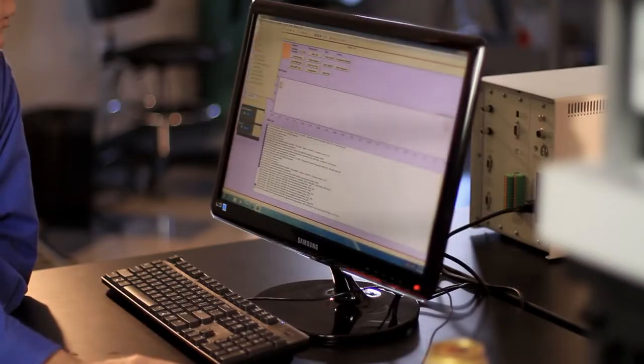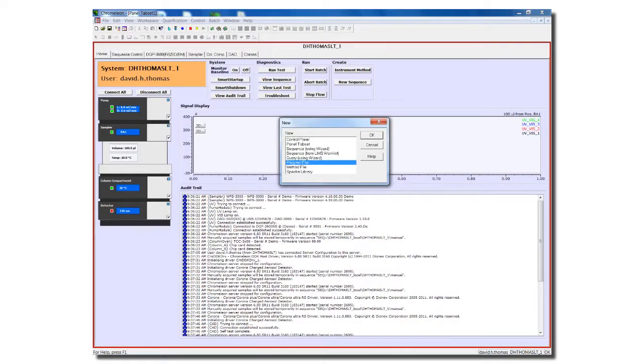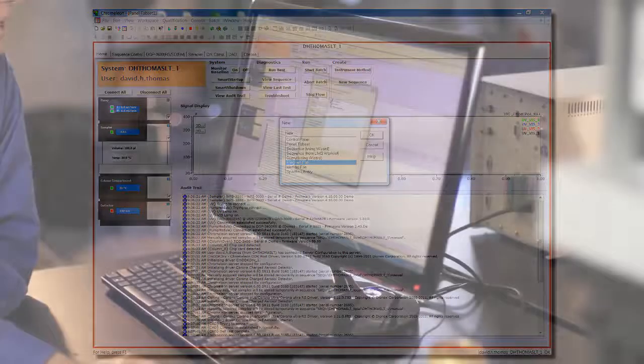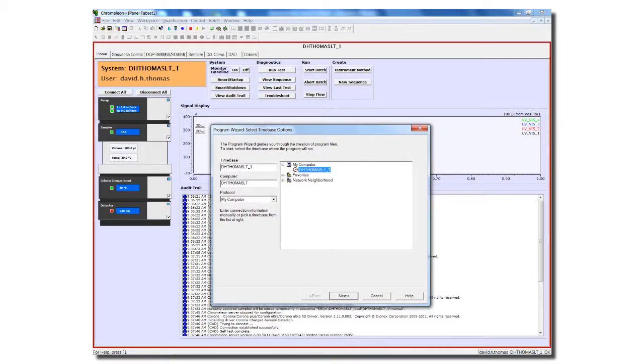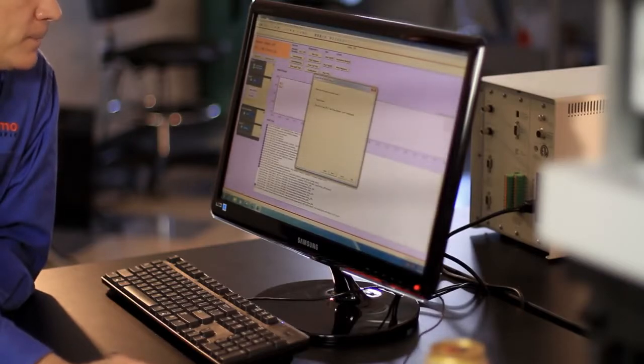So let's go through and set up a method for online SPE so that we can see how easy it is. I'm using the Thermo Scientific Chromelion chromatography data system which makes this very simple because it incorporates a smart wizard that lets you with a few mouse clicks set up a method for online SPE. So we begin by starting a new program and we assign it to the instrument that we're using. Let me point out that Chromelion is a smart CDS so it knows already what our configuration is. It knows that we have a dual gradient pump and it knows that we have the switching valve and therefore it knows already that we may want to do online SPE and it gives us that choice here. So we just choose online SPE method.